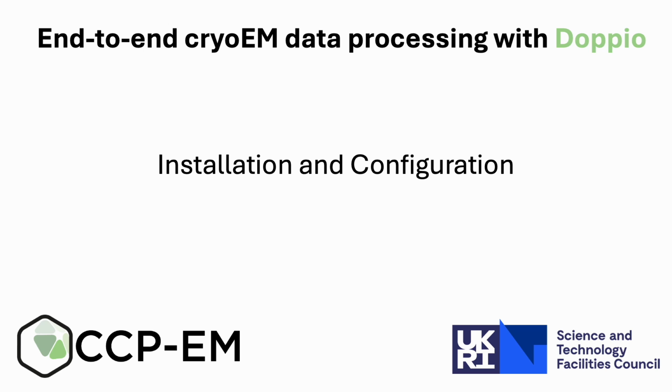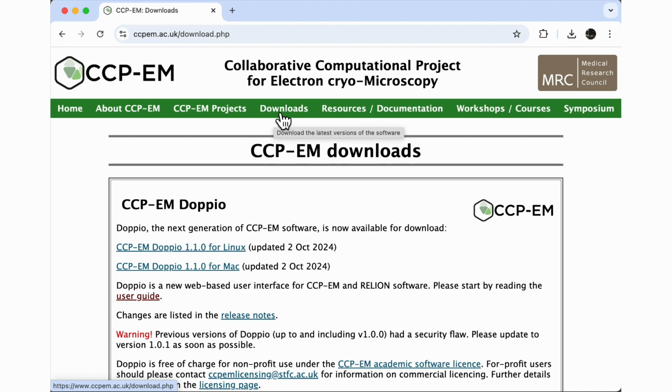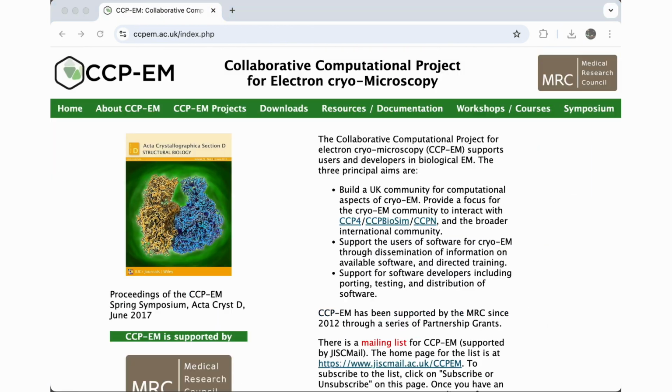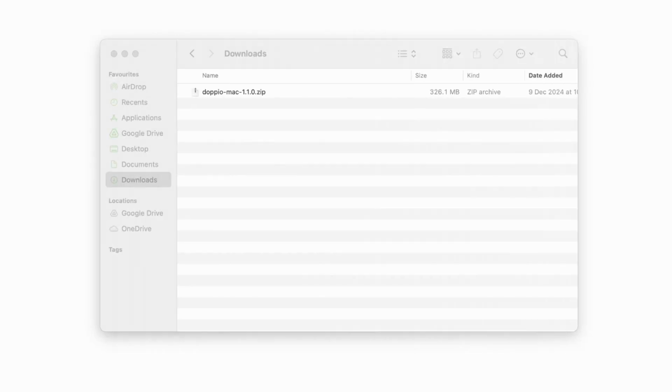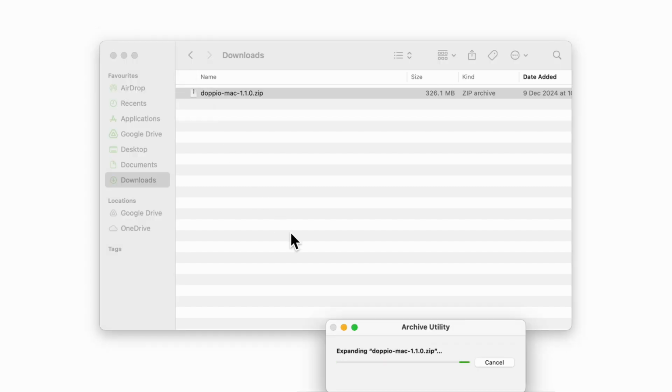This video covers installation and configuration of the Doppio software package. Doppio can be downloaded from the CCP-EM website. Go to the Downloads page and download the appropriate package for your system. Unpack the archive to get the Doppio release directory.